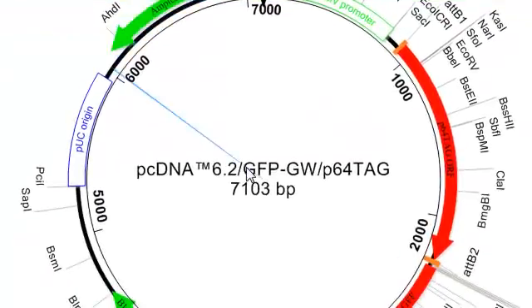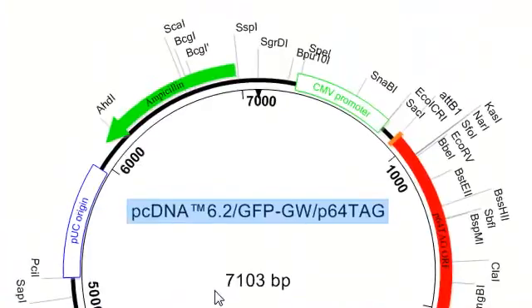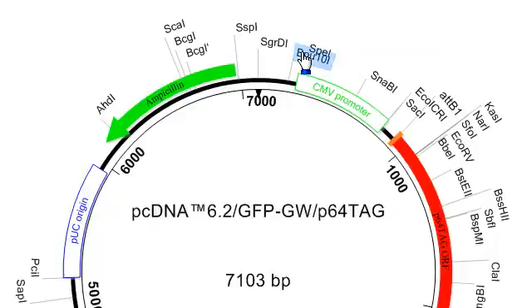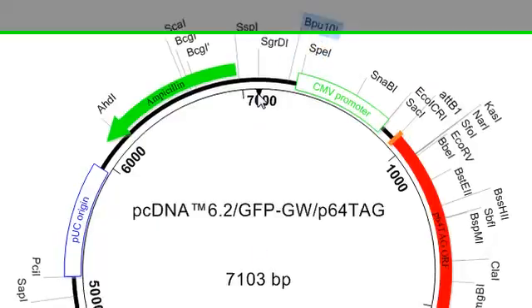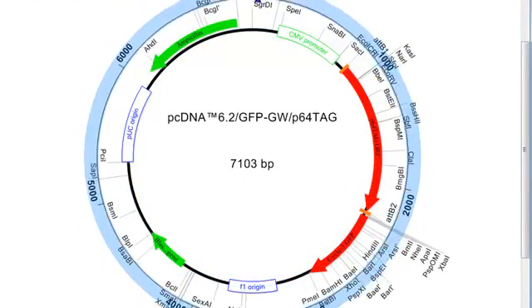I can select the title of the map and reposition it. If there's an enzyme label that's close to something else making it difficult to read, I can select it and drag it somewhere else. I can even move the ruler if I want to by selecting it and then dragging it out or in.